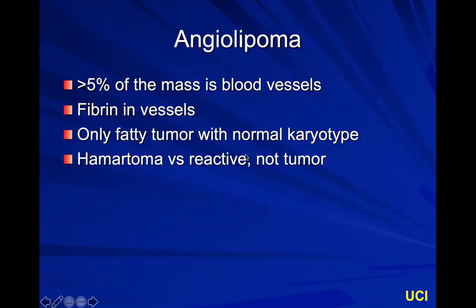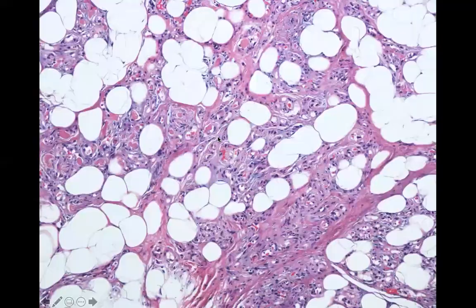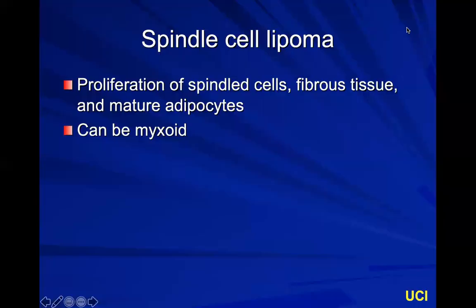An angiolipoma is when greater than five percent of the mass is composed of blood vessels, and often you'll see fibrin in the vessel walls. It can be painful. This is the only fatty tumor with a normal karyotype — it's thought to be hamartomatous or reactive, but not truly a tumor. Here you can see it's much more cellular, and between the areas of normal adipocytes you'll see increased blood vessels. Some are filled with blood and some with fibrin.